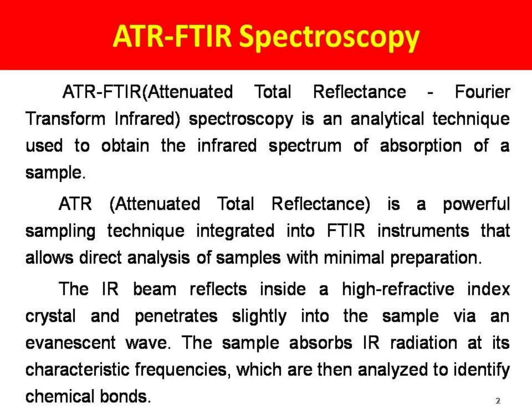ATR, that is attenuated total reflectance, is a powerful sampling technique integrated into FTIR instruments that allows direct analysis of samples with minimal preparation. The IR beam reflects inside a high refractive index crystal and penetrates slightly into the sample via an evanescent wave. The sample absorbs IR radiation at its characteristic frequencies, which are then analyzed to identify chemical bonds.